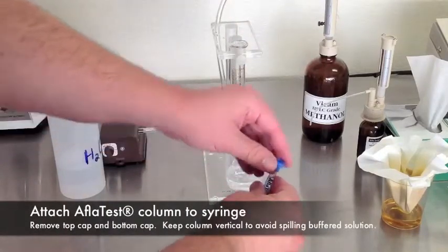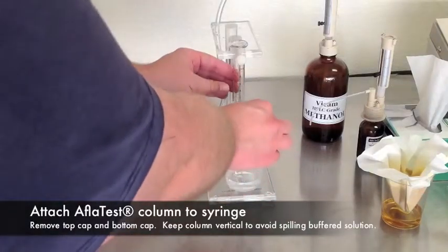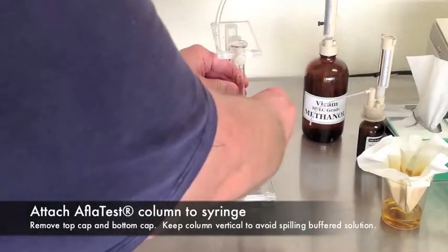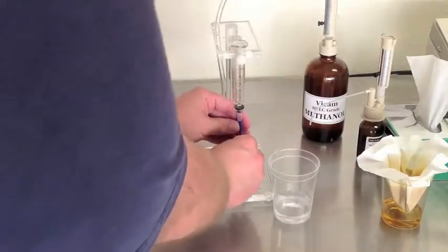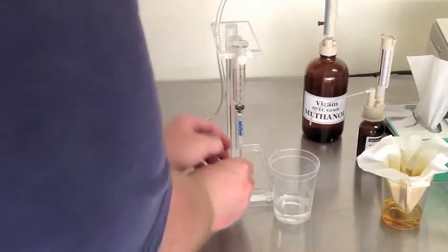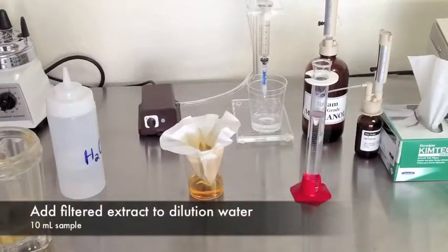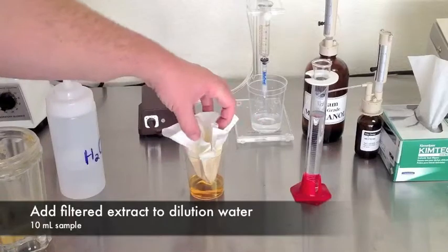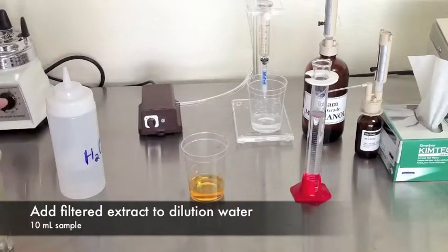Attach the AFLITest column to the syringe. The syringe coupler is simply a column cap with the bottom snipped off with a pair of scissors. If you lose the coupler, just make a new one. Now that our sample has been filtered, add 10 milliliters to our 40 milliliters of purified water to dilute.